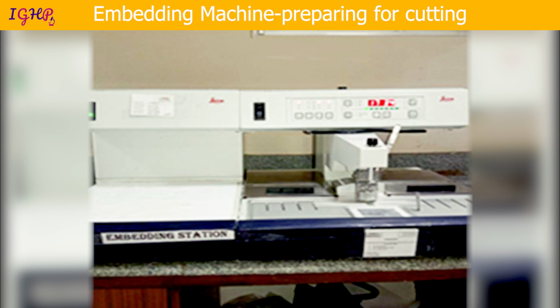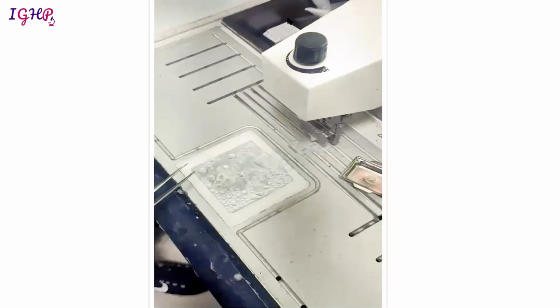So whatever tissue has been processed in the tissue processor, which takes a total duration of about 14 hours, the next day all the blocks are taken up for making the molds in the embedding machine. In this embedding machine, we take the processed tissue out from the cassettes, and then we pour some molten paraffin wax over them, and we fix them onto the lower surface of the block.